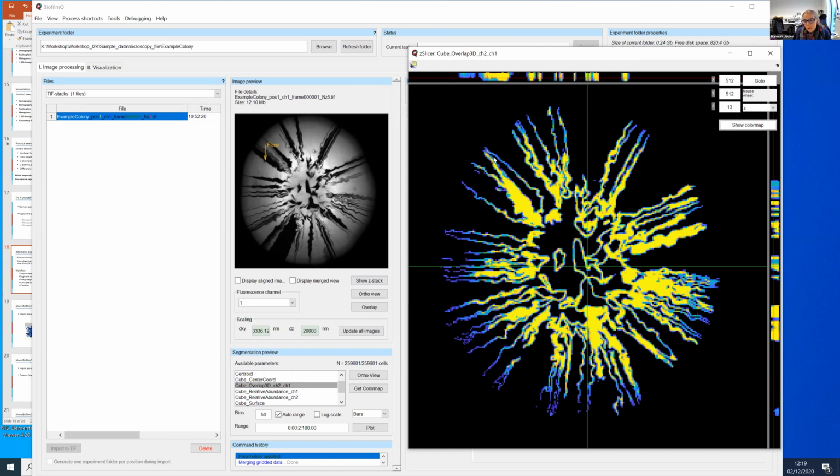But for us, it's very interesting to know that this exists. This is also why we always have to go back and check how things worked out. Here, it's important information for us to know that there are quite a few cubes that are completely filled with green and with red from the segmentation.